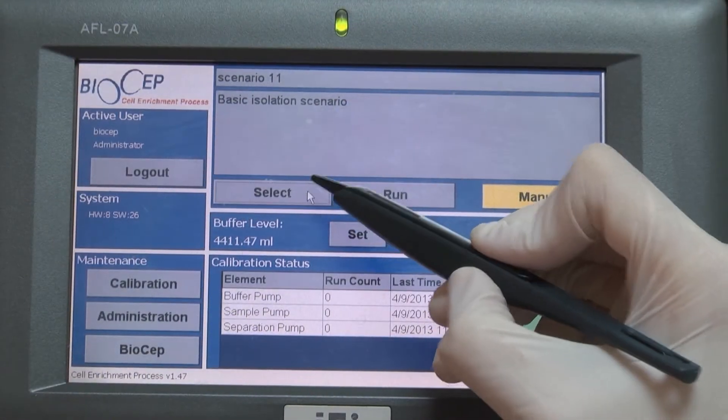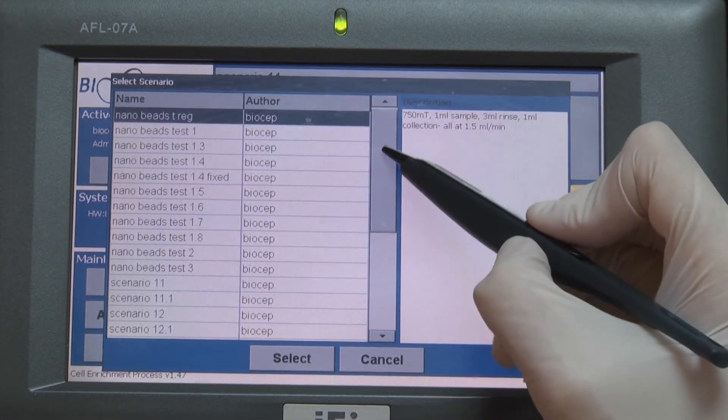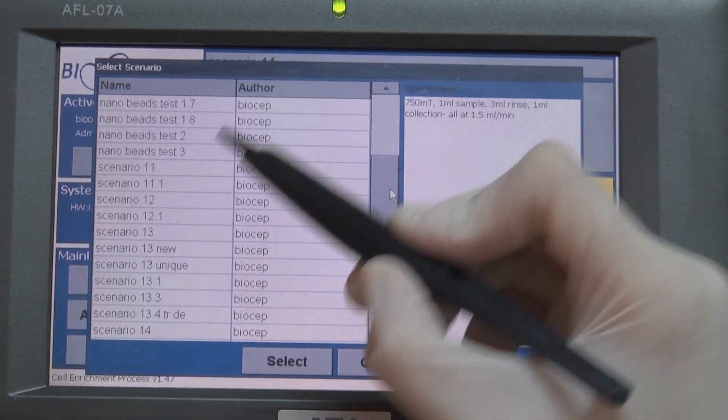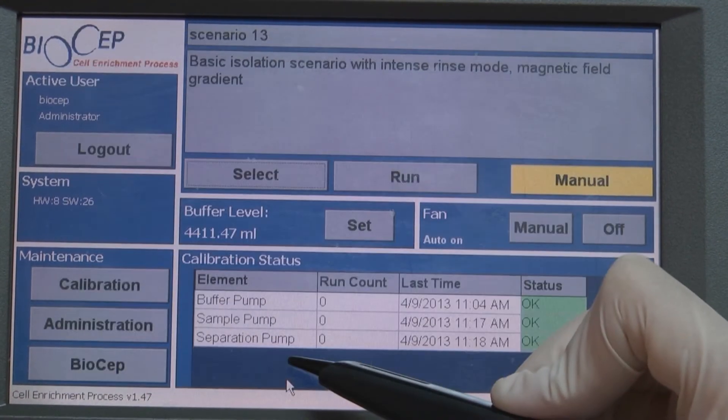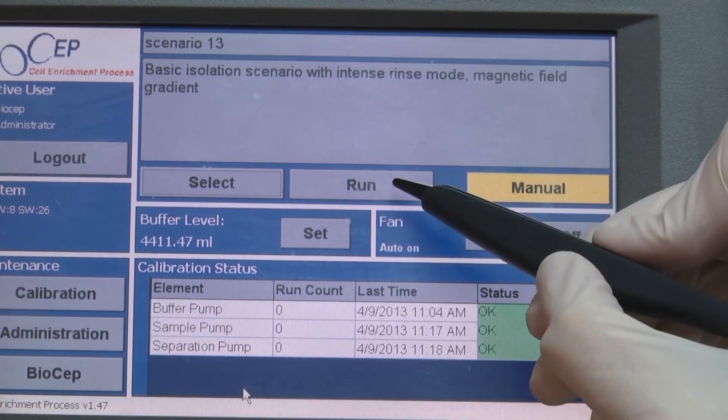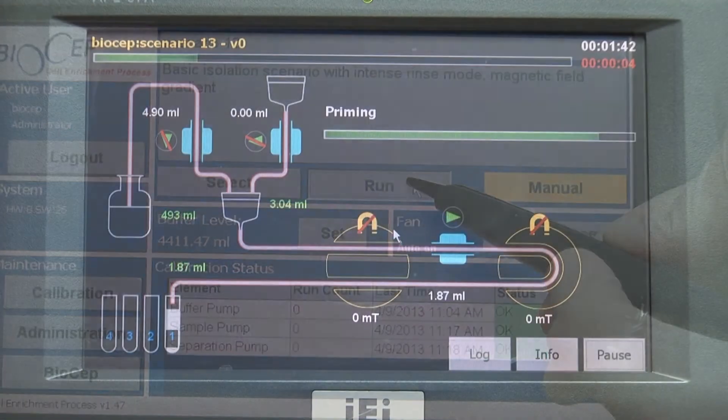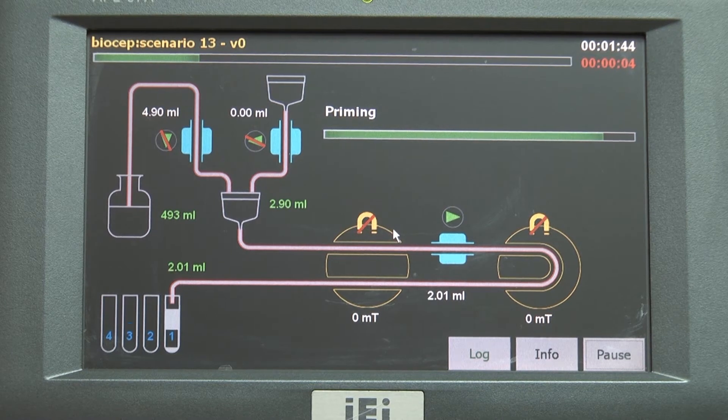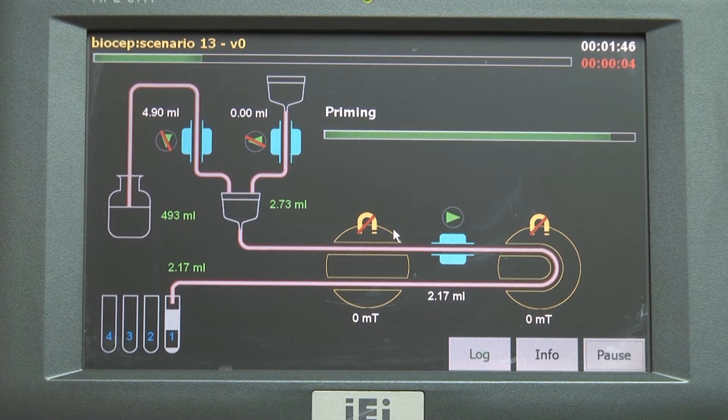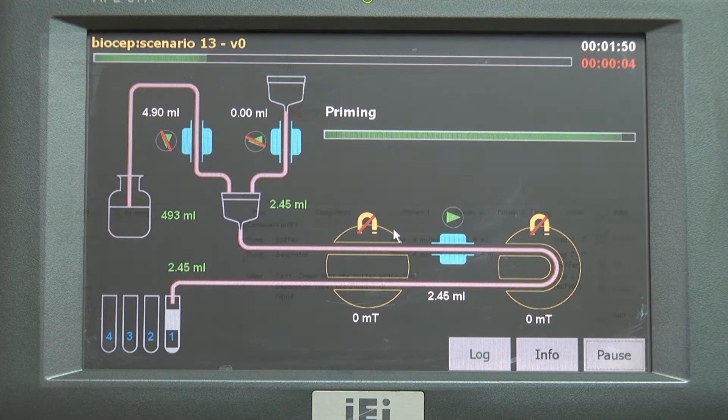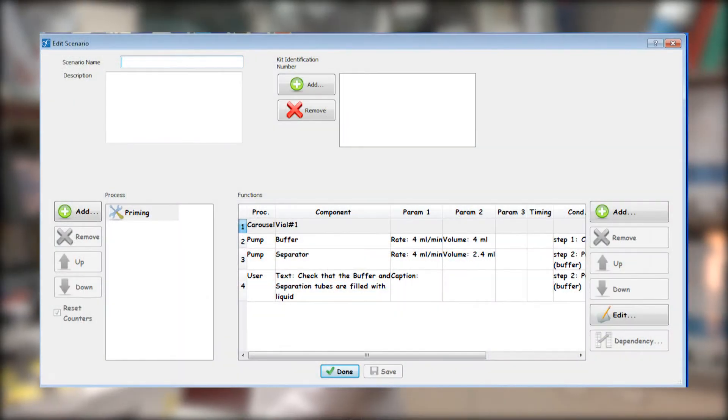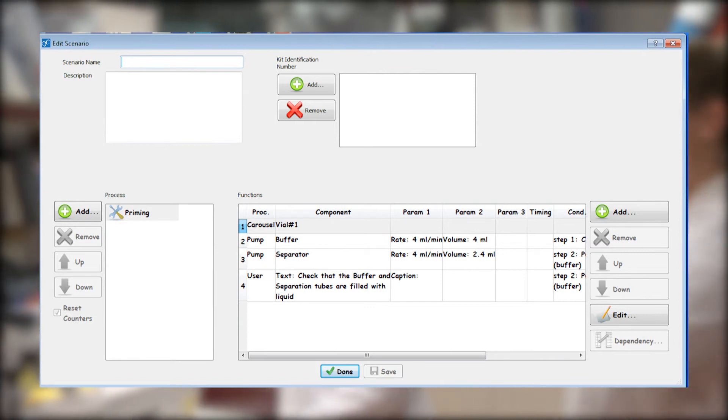Choose from any of the predefined isolation scenarios with the ease of a click, or use your own customized scenarios. Users can change separation parameters such as magnetic strength, flow rates or volumes on the touch screen software. The touch screen also portrays the entire process and progress in an easy to understand graphical manner. Unique customized protocols can be created on the separately supplied PC Scenario Creator software.